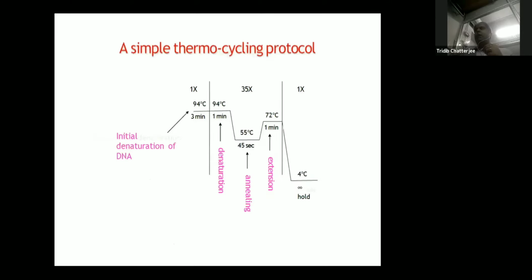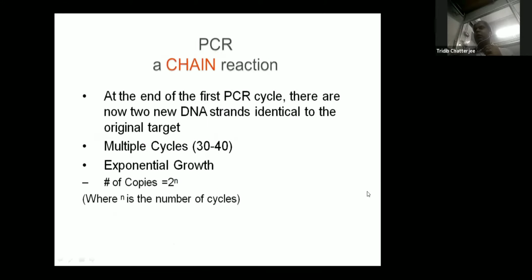And if I plot it, it looks like this. Then initial denaturation, next the cycling process, which happens for a certain number of cycles, and then the final end of it can hold in the machines. So if the growth is exponential, as I already told and Madam also told, the copy number is 2 to the power n ideally, but practically we do not find this. Why do we not find this, and how is it found, and at what position? We will see the exact data if we see the real-time PCR.